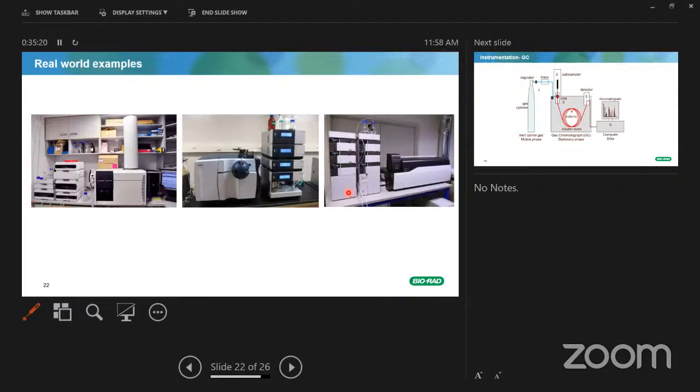On a day-to-day basis, HPLC or LC-MS looks almost the same. For example, we have a TOF, that is a time of flight detector. This is a triple quad, that is a quadrupole detector, and this is the LC, the liquid chromatography. Again, we'll come to see what applications these all serve. This, for example, is the ion trap. So multiple things. This is how you see them day to day when you come across labs, academia and industries. This is how the setups are usually stacked up for LC-MS or HPLC-MS platforms.